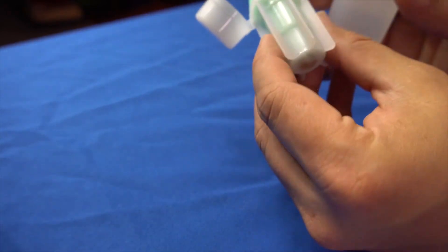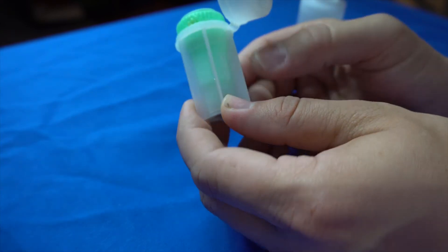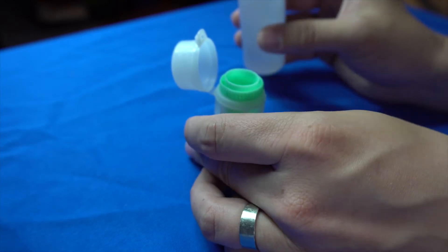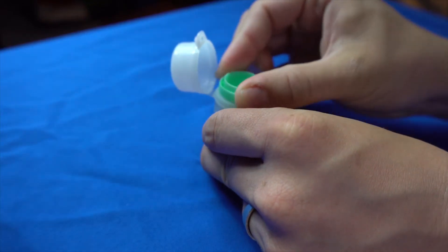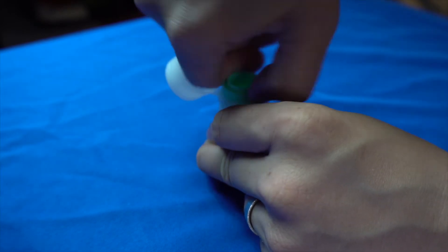Once you have your sample, what you're going to want to do is look for the fill line — the fill line is around right here. You're going to want to fill it slowly, only to that line. And then what you're going to want to do is agitate this left and right for about 30 seconds. Don't shake these containers because you'll get poop all over your fingers.